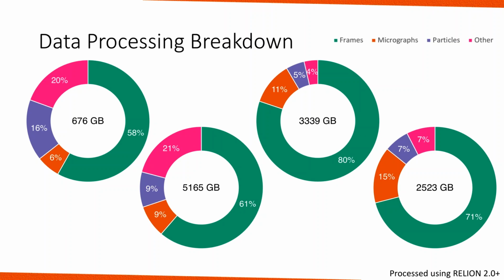If you have a couple petabytes of storage and you're not really putting pressure on your users, they will fill up your storage. This person could have used another 50%, another couple terabytes to process the data. So always be prepared for that. Always make sure that your users have room to grow.